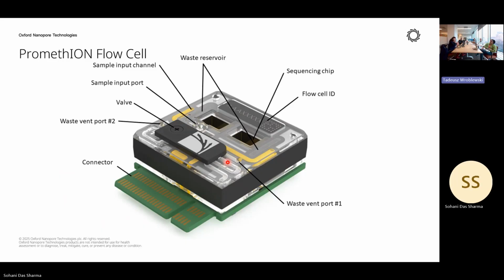Let's say you are using Illumina, then the maximum fragment length you can get, I think, is close to 250 or 300 base pairs. If you use NextSeq, which I used for a while, I think it was 75 bases. So that's a very different chemistry. When I said fragmentation, it's not RNA though, it's gDNA. And gDNA is a really long thread, right? So you can do without fragmentation, that's fine.